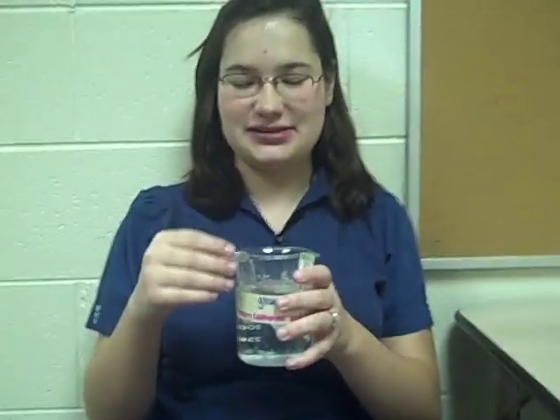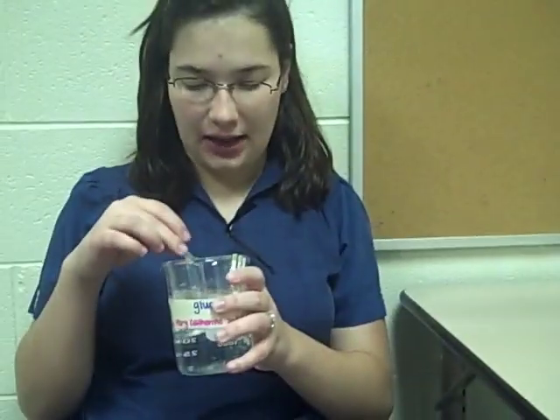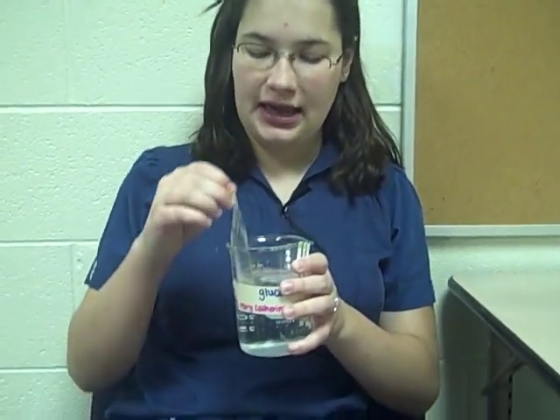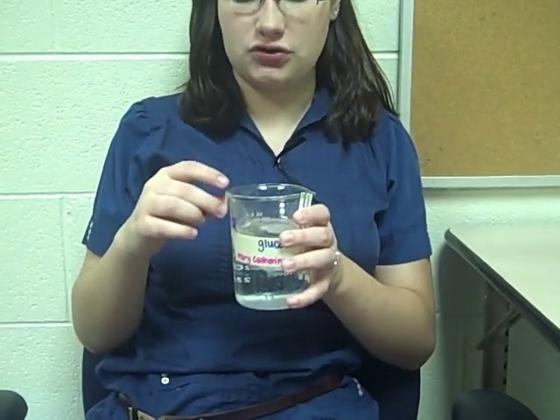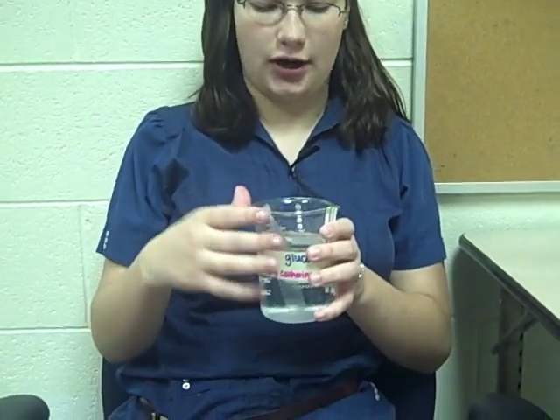This is our osmosis and diffusion through a membrane lab. We started off by making a hypothesis. The hypothesis for the glucose was that if cellulose tubing full of a glucose solution was placed into distilled water, the glucose would diffuse out of the cellulose membrane and into the distilled water.